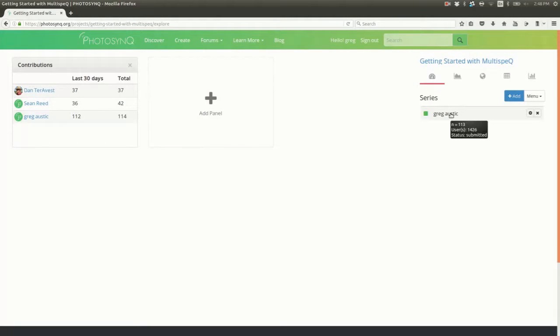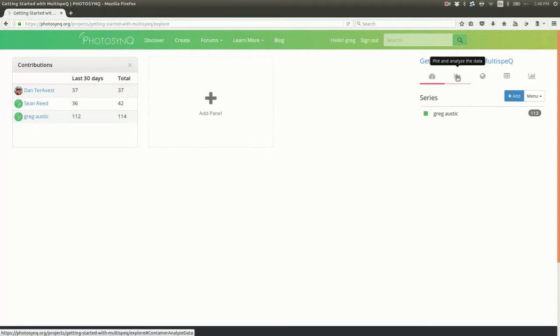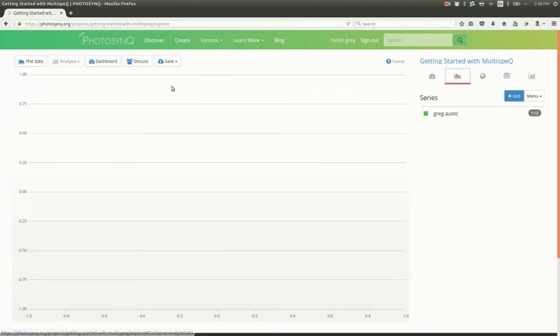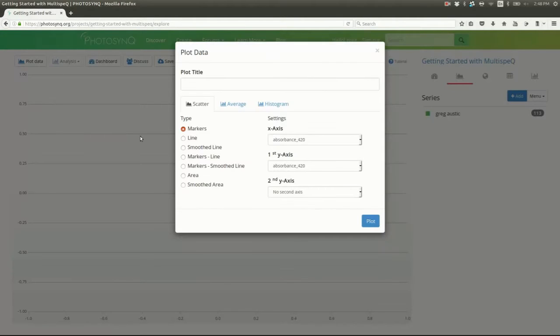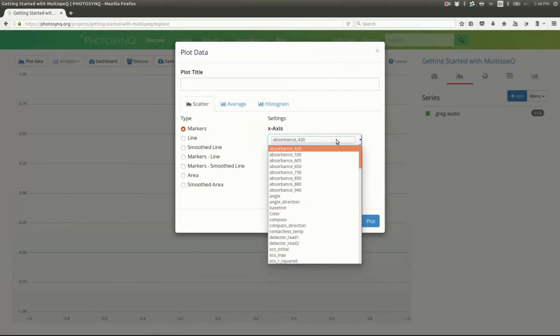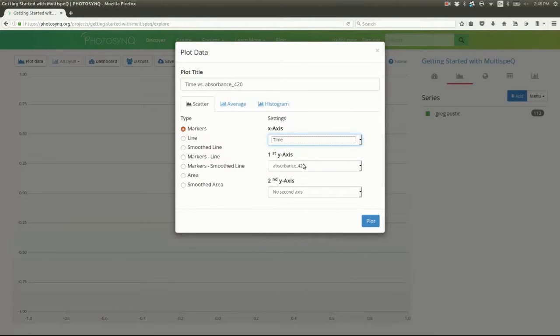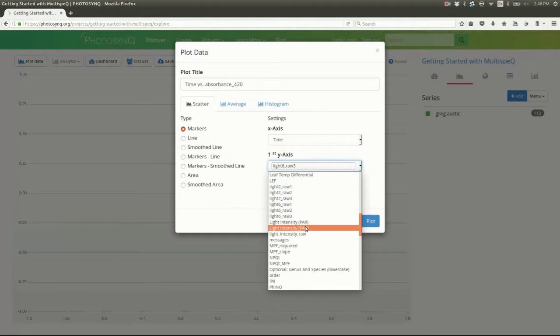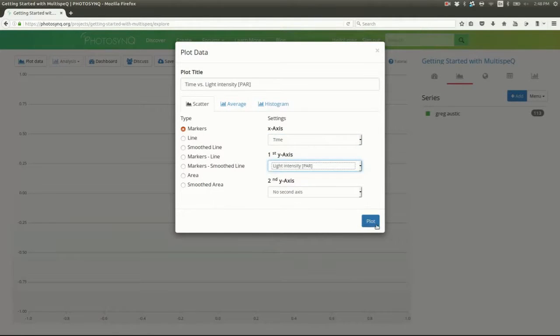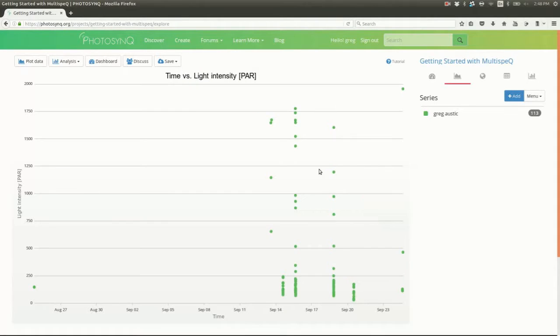Okay, so let's find our specific data point. We can plot our data by time by clicking on the plot icon, plot data, and choosing time on the X and light intensity on the Y. Great. Here's the date range I collected the data.